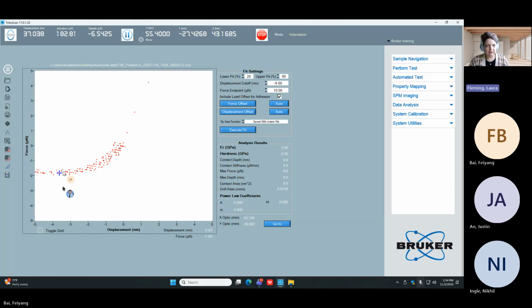It also does something else. It's going to open up the next indent in the same view window. So after you click Control G, we're going to go from 4 to 5. I want to go back to 4 because we're going to look at it, but let's go ahead and re-zero this one now. So go ahead and click Control G.